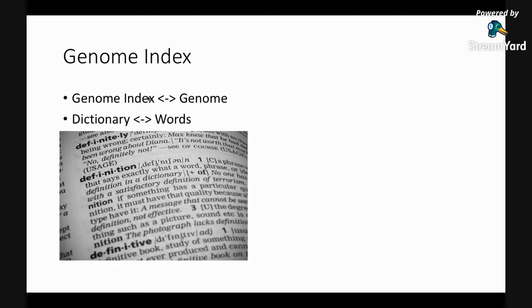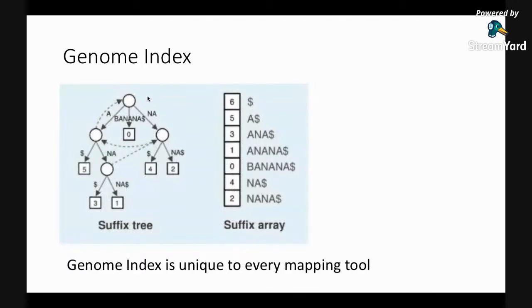And then instead of searching for your sequence, you actually search for these short k-mers. So let's say you search for 8 base pairs together. And all of these 8 base pairs are then arranged just like in a dictionary, systematically, right? And along with their location on the genome, right? So this is one example.